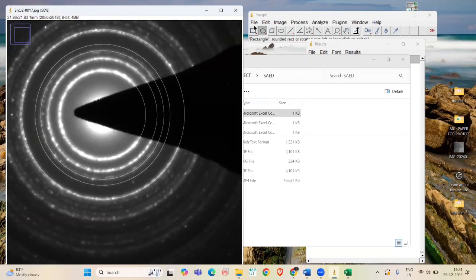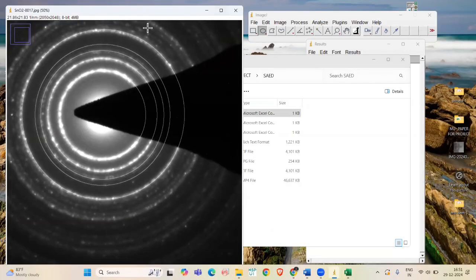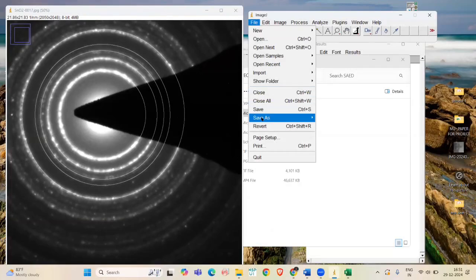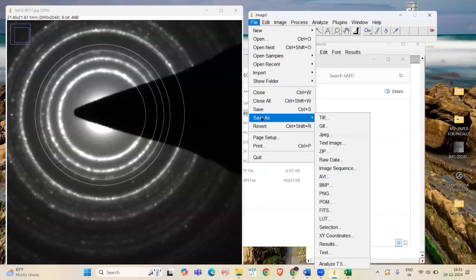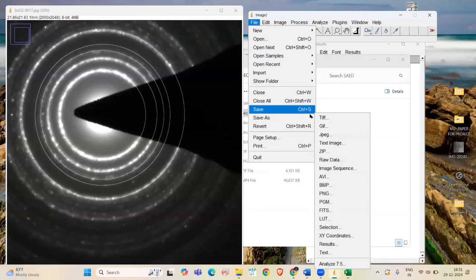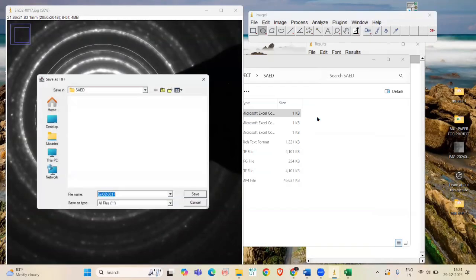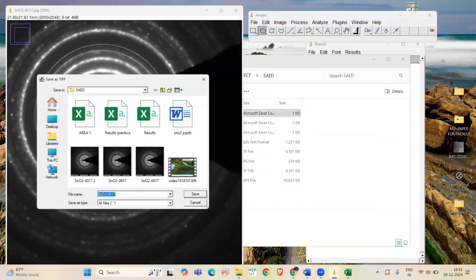Now, save your SAED pattern by going to File and select Save As and select TIFF format to get a quality pattern.